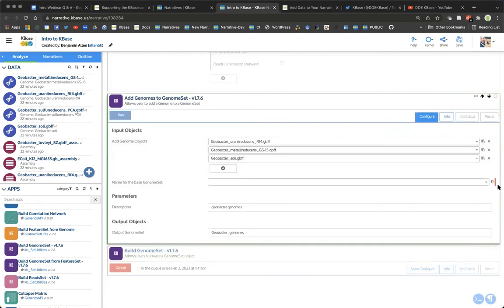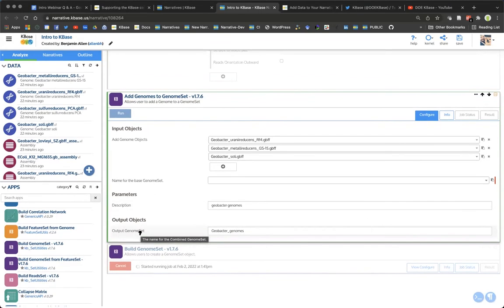So before, it is giving me this small red indicator on the right-hand side here that I need to fill something out in this tool before it will let me run it. So if you're trying to click run and it's giving you this crossed out section here and it's grayed out, it means you haven't put in all of the things that you need to do to run the app. So just be aware of that if you're running into that issue.